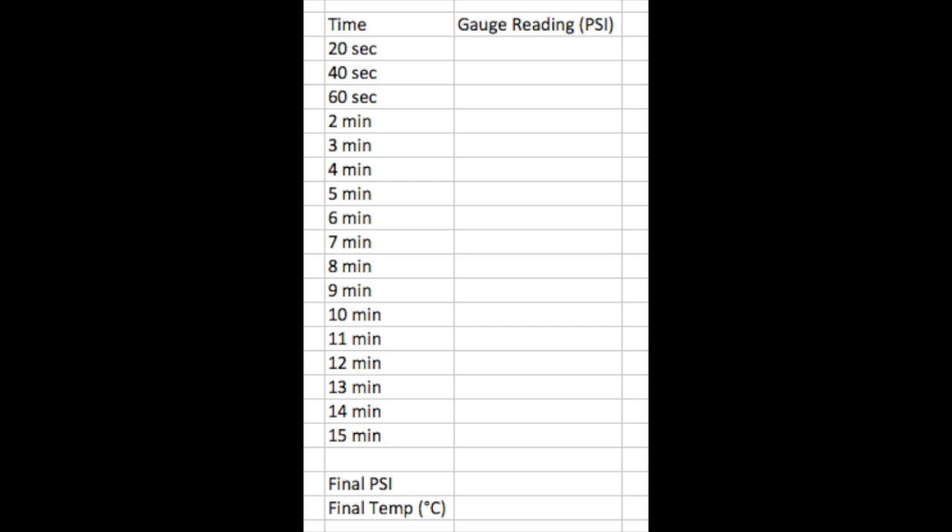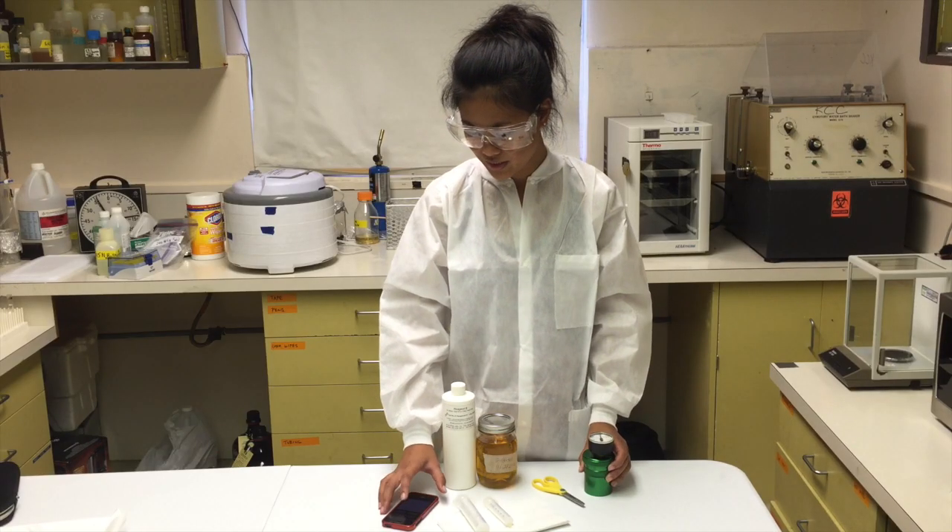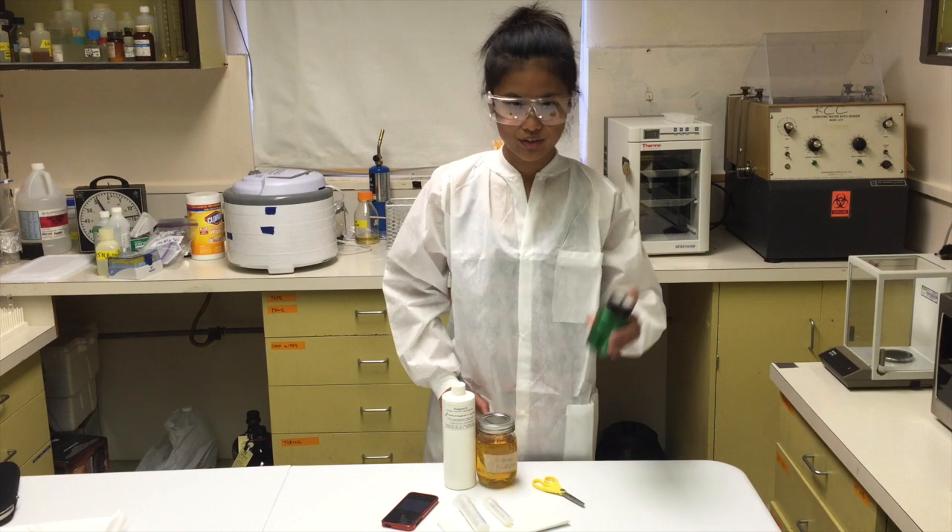Don't forget to record the temperature at the end of the 15 minutes along with your final psi. So now we're going to start the timer and we're going to shake the vessel vigorously.